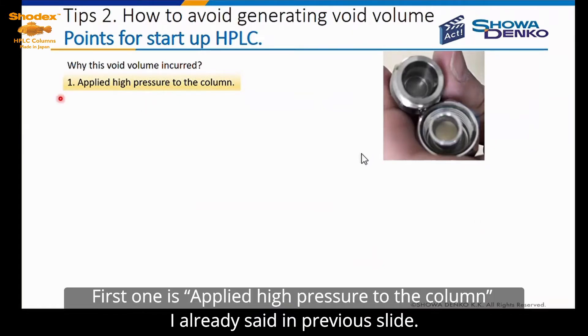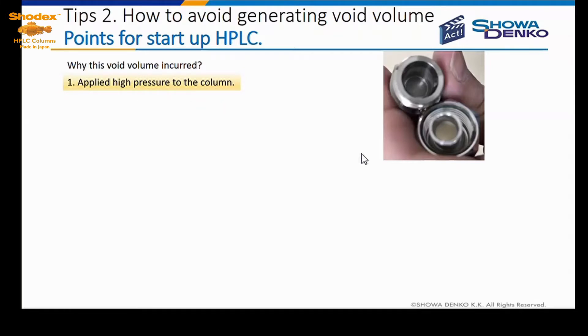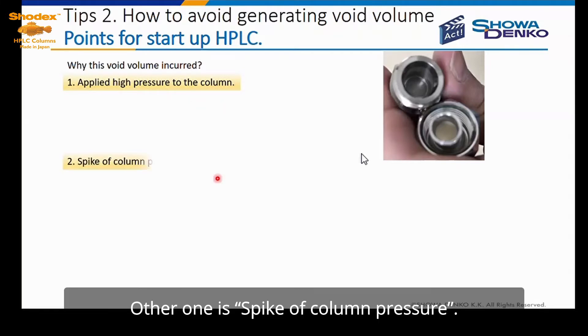The first one is applying high pressure to the column, as already mentioned in the previous slide. The other one is a spike of column pressure.